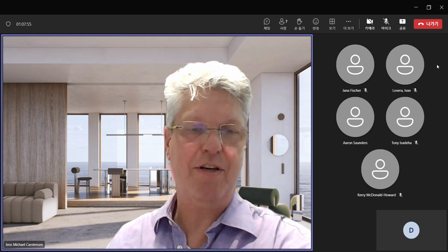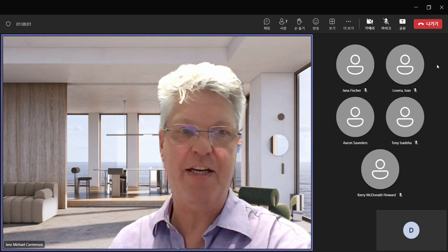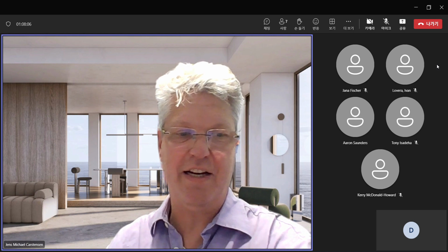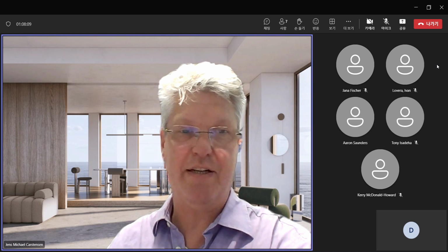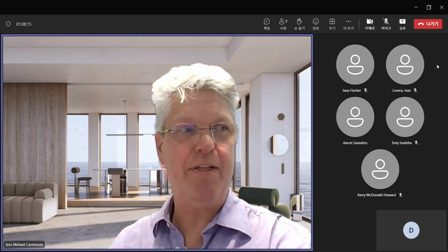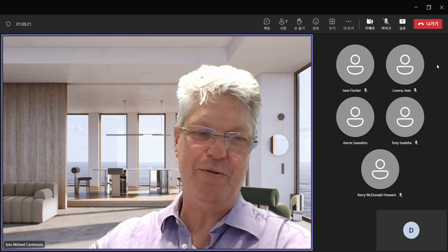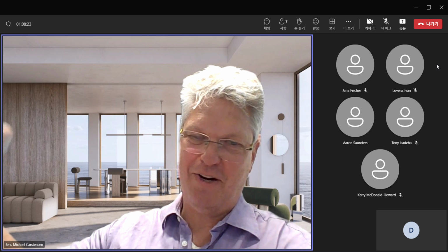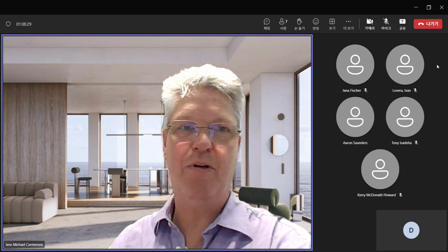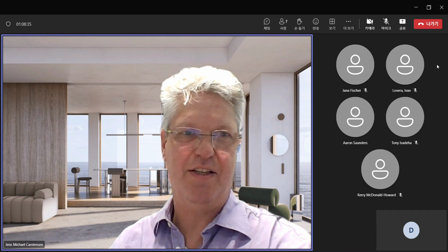I will say just a general comment on logistic, that you can choose in the advanced setting of NCDA. Instead of making the NCDA linear, it will saturate around -1 and +1. So it will not be directly a classification, but it will be more close. It will move into more or less reddish or bluish area and very little in between, making it more obvious that the separation is clear.